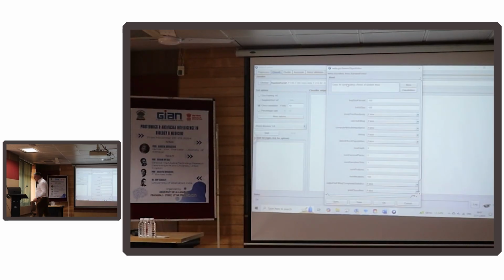If I look at the help for Weka, it's not immediately here, but if you look it up in the help, say random forest, it will tell you what these mean. But if you move the cursor over, it does give you an indication as well. So for example, number of iterations, how many trees am I going to make in the forest? If I look at number of decimal places, that's just rounding. If I look at the batch size, this is the number of instances to process.